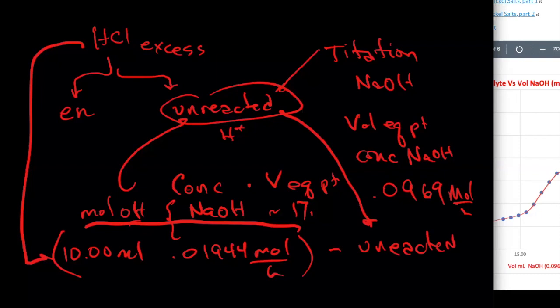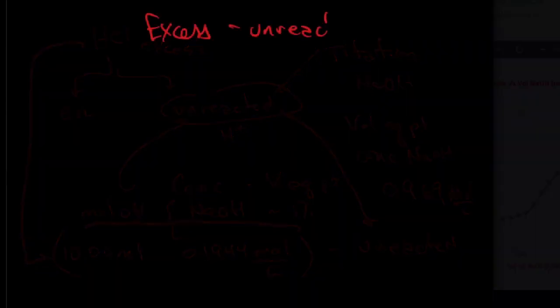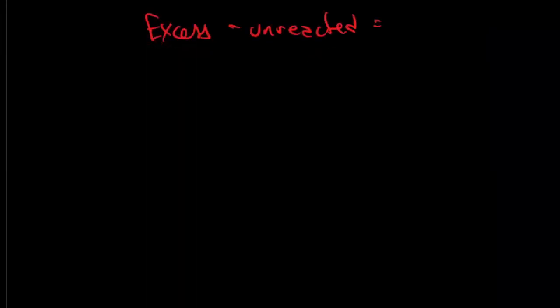If you subtract the amount that is unreacted from the amount that you added, it equals the amount that reacted with ethylene diamine.